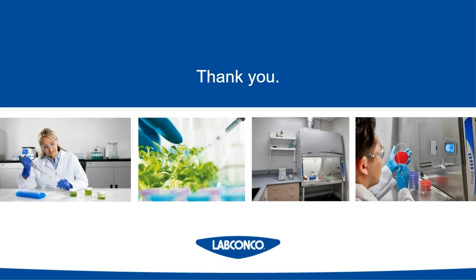All right, wonderful. Our next question here is, I'm not clear on why a C1 is more beneficial in a cell culture room than a B2. Can you explain? That's a really good question. And it depends, again, the B2 or C1 would be the cabinets you would look at if you're using chemicals that require exhausting. A lot of times cell culture rooms or cell culture suites are very small.